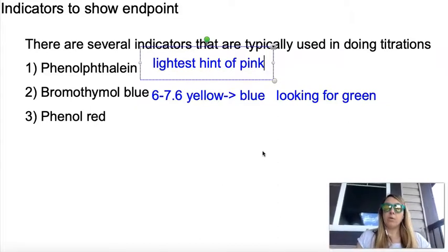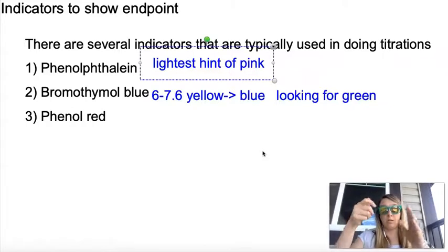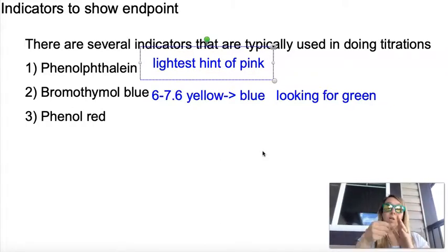But then that narrows down my range, and I can be like, okay, well, I know it didn't change in my first 10 mLs. So when I go to do my next trial, where now I actually have an idea what I'm looking for, I can add those first 10 mLs in one big go, just open it and let it run. I hit 10, I close it.